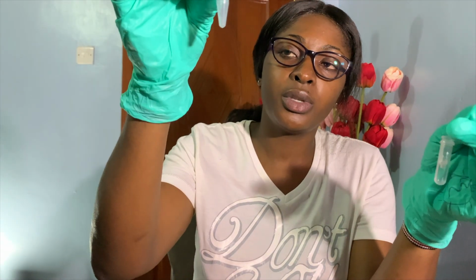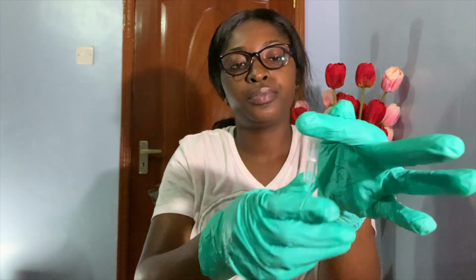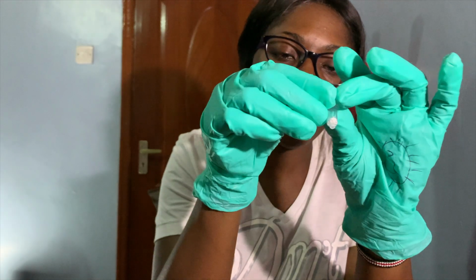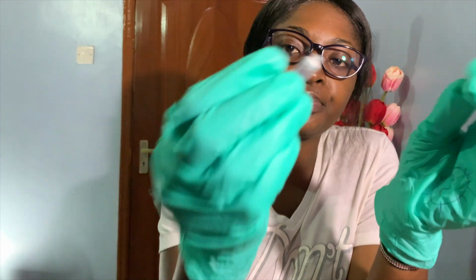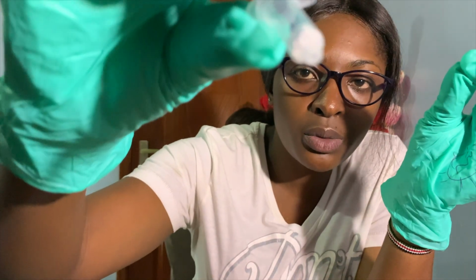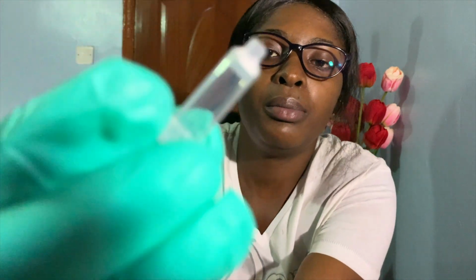Again, with your left hand, open it, move the fluid from the tube where you added your proteinase K and your lysis buffer, put it in here, and close it. A little science of what happens here: this tip has some sort of a filter. I'm not sure whether you can see it, but it has a filter in there.